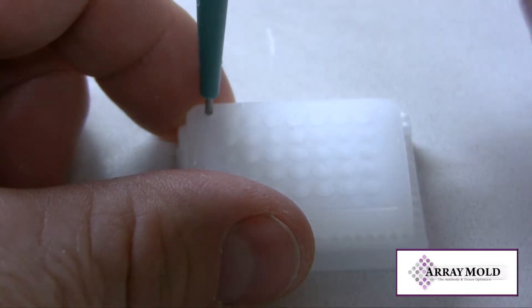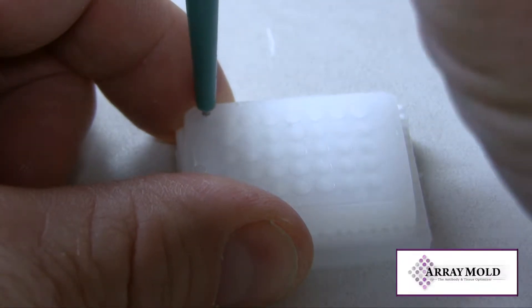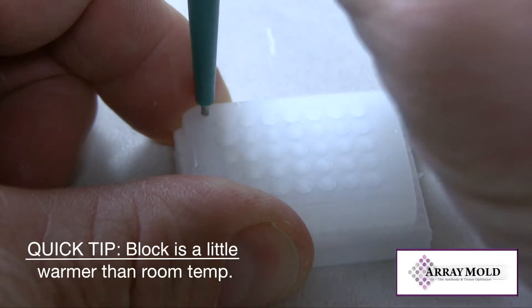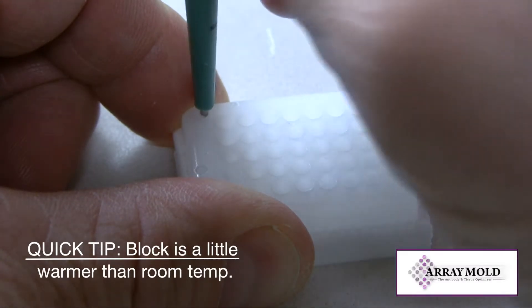Punch the array block with the 1mm needle. The outside diameter of this needle is slightly smaller than the core size of the 1.5mm needle. Try to make the diameter a little bigger as I am doing here so the punch from the 1.5mm needle will fit.